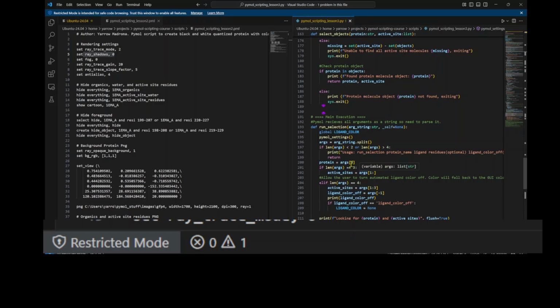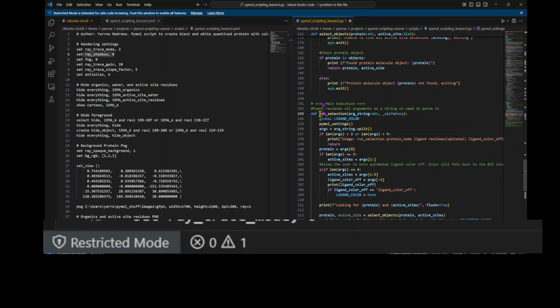But in doing Python in PyMOL, it kind of obscures it a little bit. You can't run that because you're basically in a namespace, the PyMOL namespace, inside of another namespace. So instead of running that, you'll run basically another function that runs everything else.